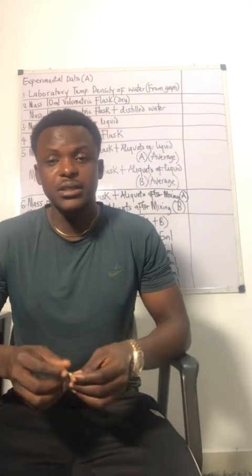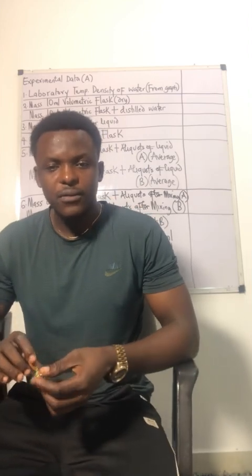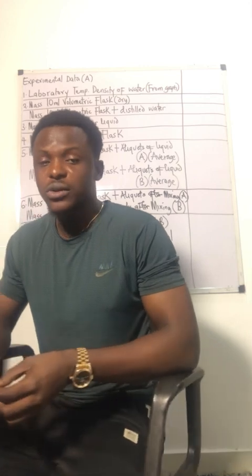Today I'll be taking us on chemistry practicals. The title of the practical is Measurement in Chemistry: Volume Changes Accompanying Mixtures of Liquids. Now you know that in every practical there is always an objective. So the objective of this experiment is to investigate the volume changes upon mixture of liquids. It's basically to test if there will be volume conservation or not.